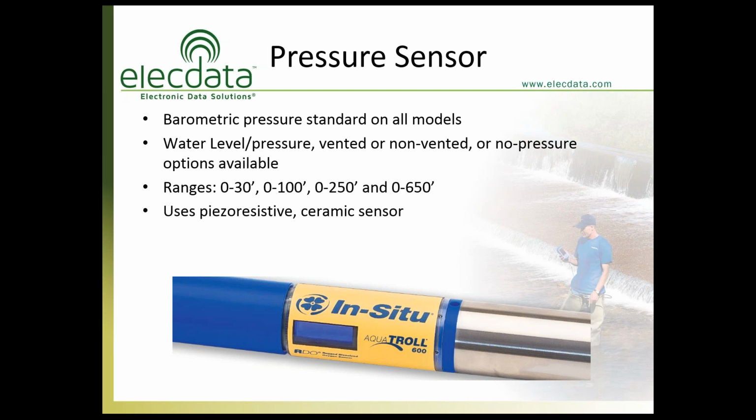The other thing that the barometric pressure sensor does for you is it provides real-time compensation of your percent saturation of dissolved oxygen sensor readings. So obviously the percent saturation data depends a little bit on the barometric pressure, so we compensate those in real time. If you're pumping a well or taking a measurement in a lake, the percent saturation readings that you're seeing are compensated in real time for the current barometric pressure.